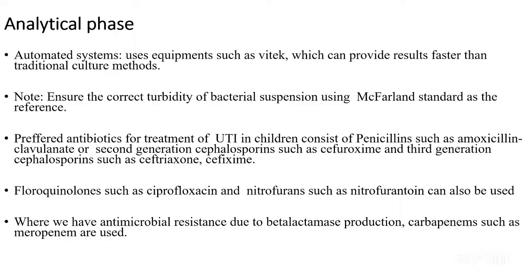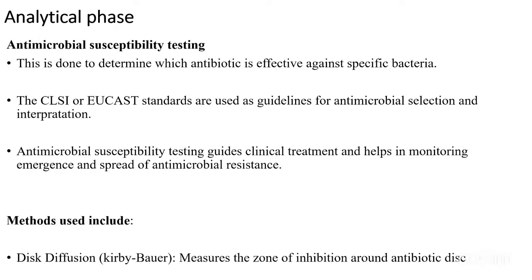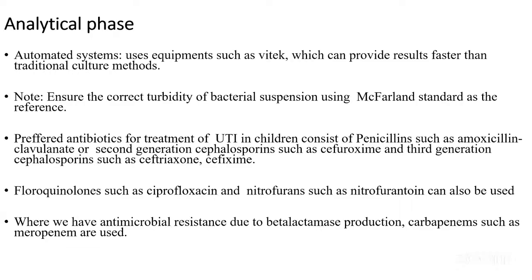You prepare your bacterial suspension and ensure it's within the McFarland standard. Then for the conventional one, the disc diffusion, you will swab the Mueller-Hinton plate with the suspension, let it dry and place your drugs 15 millimeters apart. Then you will incubate for 24 hours and read your zones of inhibition. For automatic systems, you will prepare the McFarland solution and place it in the automated system.